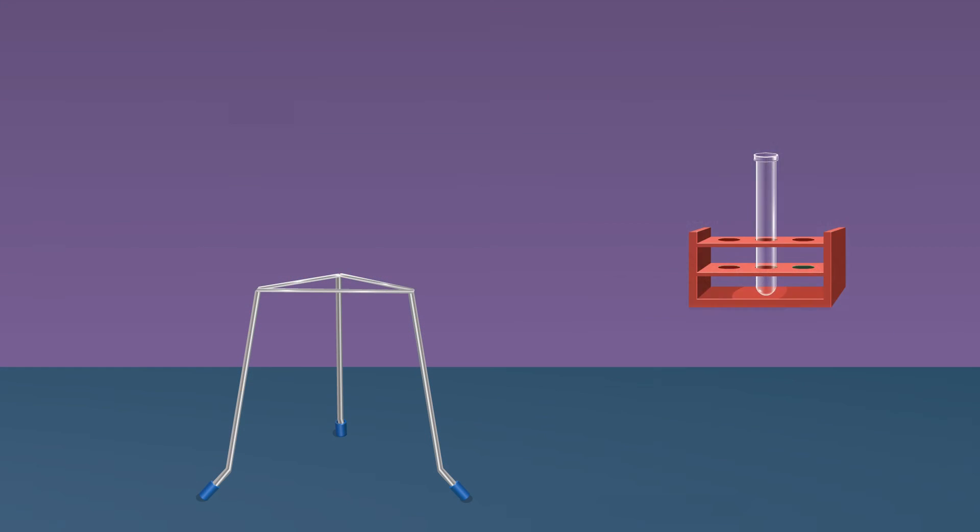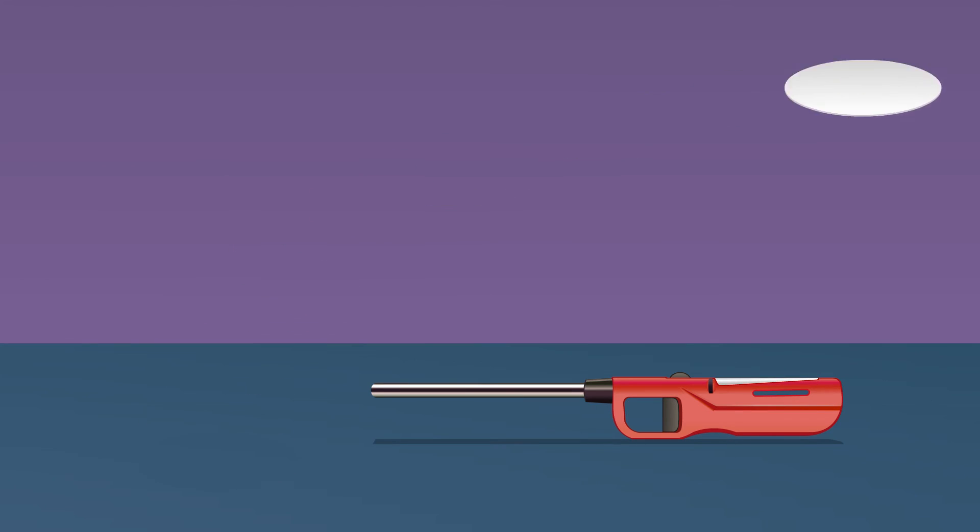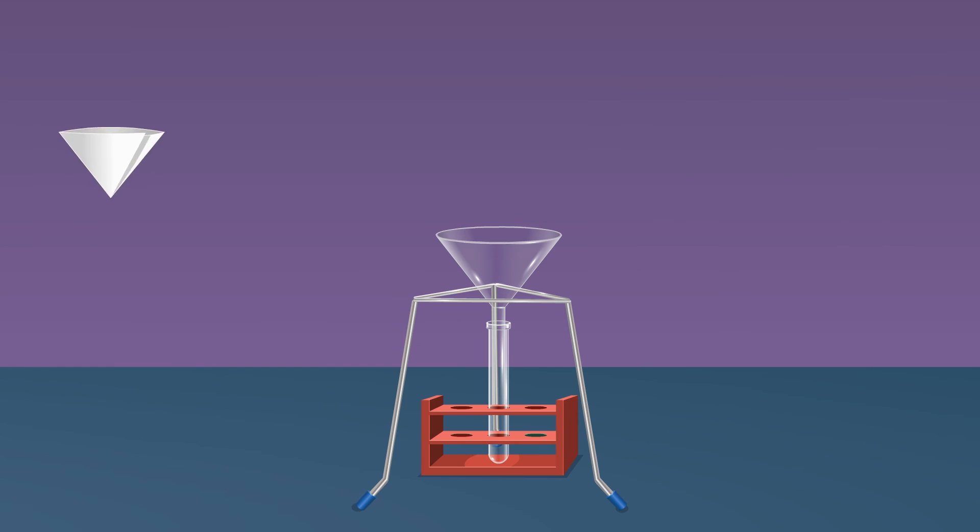Place a boiling tube below the tripod stand and then place a funnel in the tripod stand. Then take the filter paper and fold it as shown and place it inside the funnel. Filter the content in the boiling tube using a filter paper.